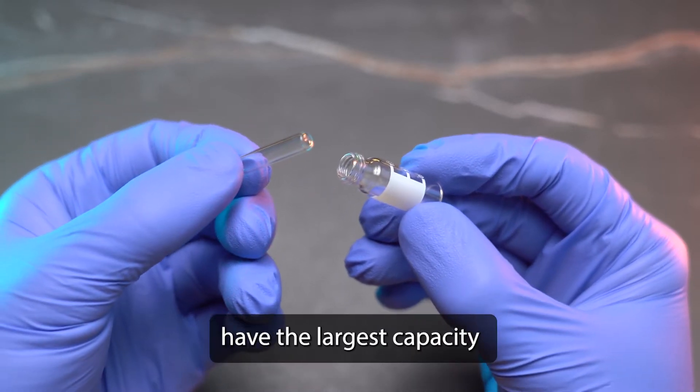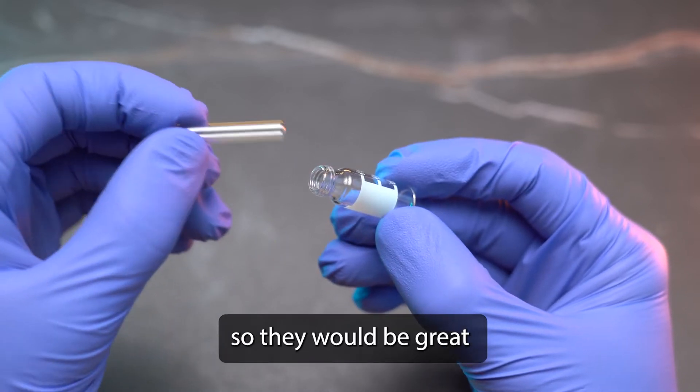These flat bottom glass inserts have the largest capacity for filling up your sample, so they would be great for being economical.